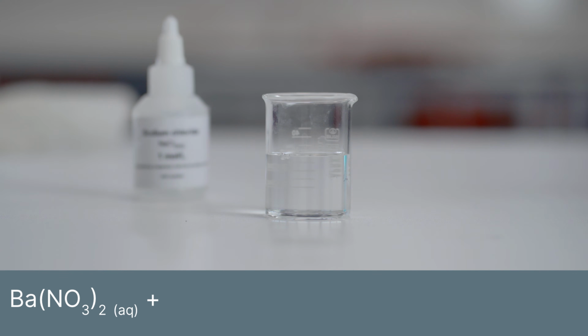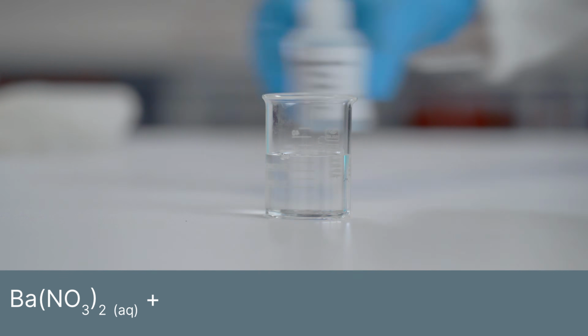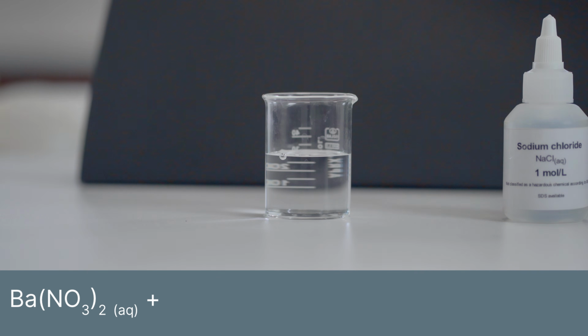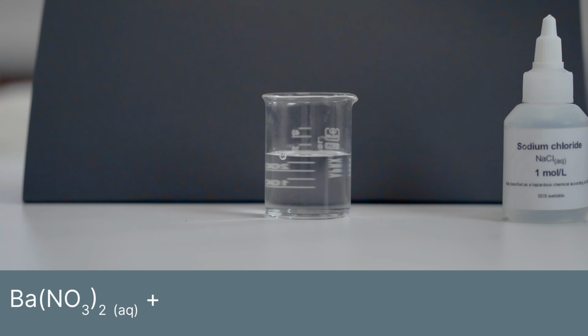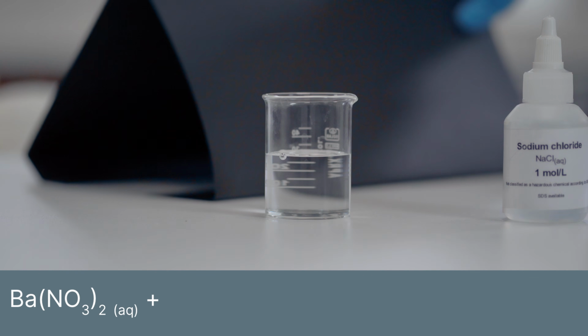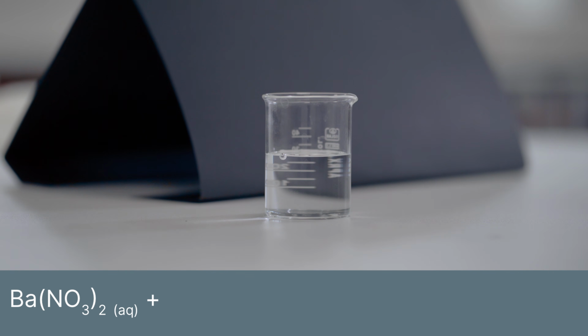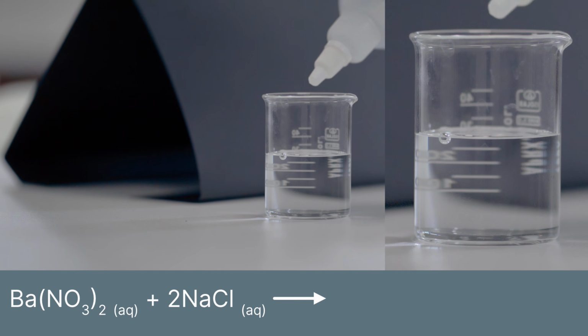However, in the event that it does form a white precipitate, I've just got a bit of black cardboard here to provide a bit of contrast in the background. So hopefully you're able to pick that up on camera. So I'll just put that up nice and close. Might put it that way so we can get a bit of lighting. Okay, here we go with our second reagent, which is sodium chloride. Just going to add a few drops.